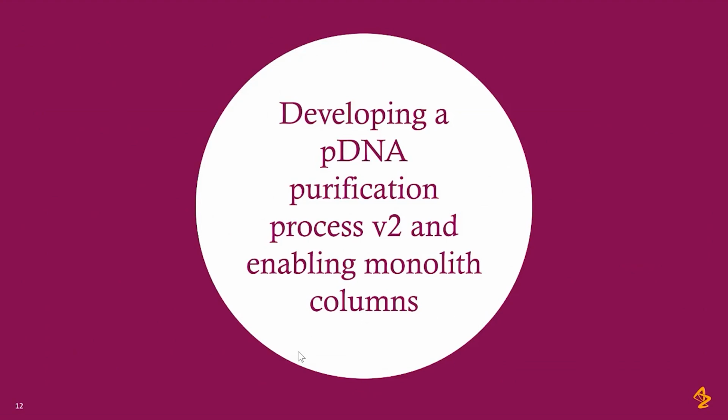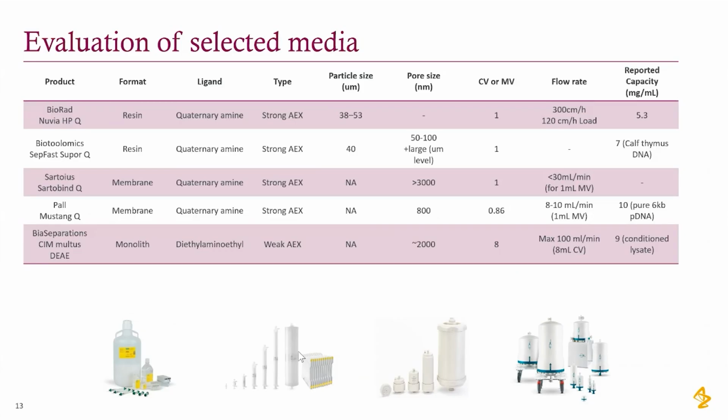What we did was look at what chromatography media vendors are suggesting, what they have developed for plasmid DNA capture. We made a table where we put all the available information in one place, and we started doing evaluation and screening studies of those resins, media and membranes.